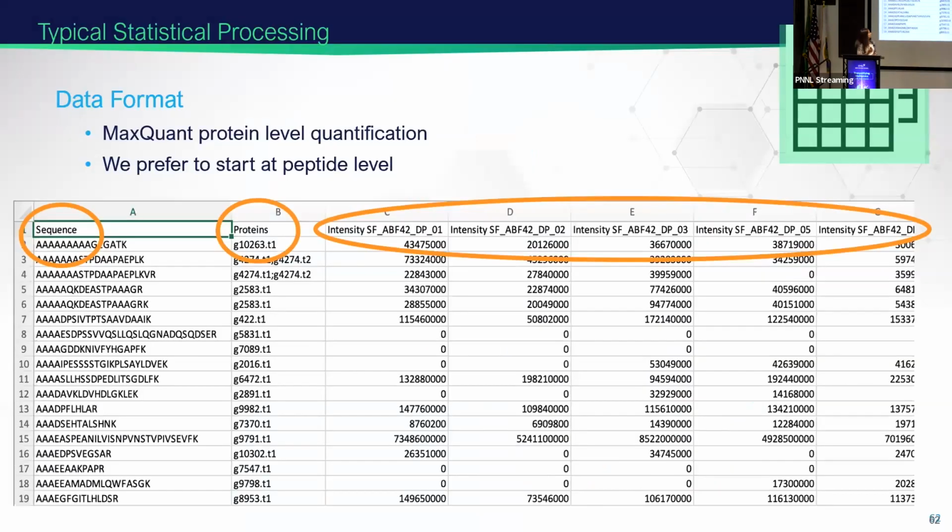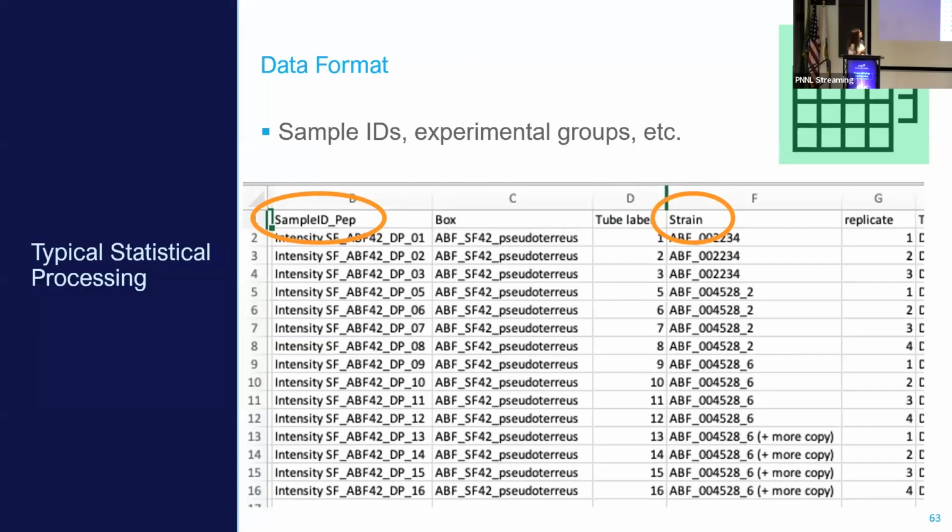All right, so David gave us a nice overview of the different data that we need in order to use this type of workflow. So I won't spend much time here other than to say, we have our peptide level information, that mapping to proteins, and then the observed relative abundances for each of our samples. We also have information for the samples about experimental groups of interest. This could also include things like run order. Sometimes we like to visualize our data in run order to see if there's any sort of effect of that order on what we're observing in our samples.